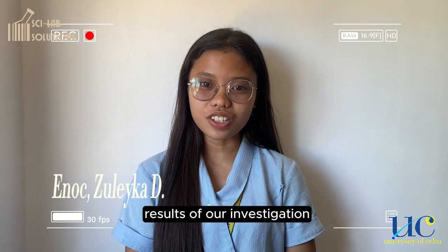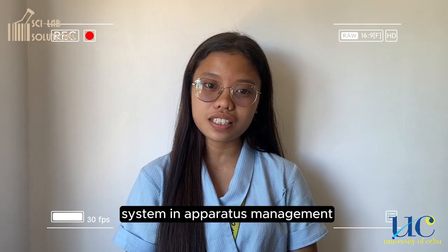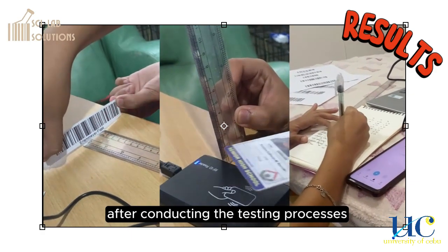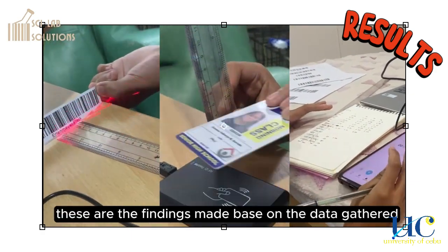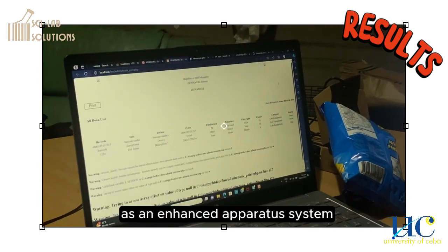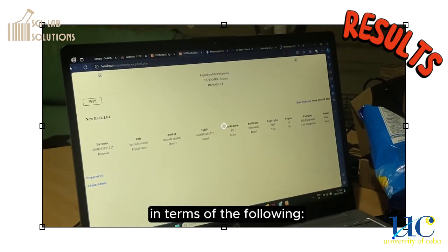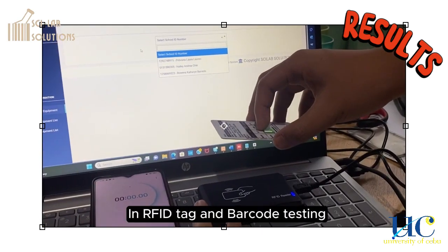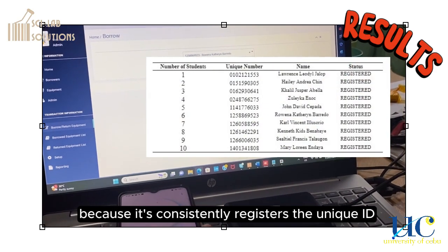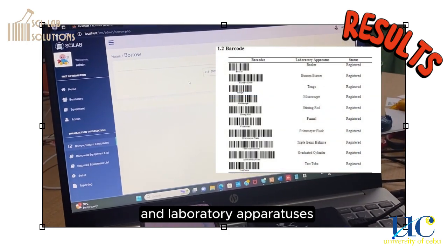Now, let us analyze the results of our investigation about the performance and efficiency of the Scilab solution system in apparatus management. After conducting the testing processes, these are the findings made based on the data gathered. First, the Scilab solution system is efficient as an enhanced apparatus system. Second, the Scilab solution system is efficient in terms of the following. In RFID tag and barcode testing, the Scilab solution system is functional and reliable because it consistently registers the unique ID numbers and barcodes of the tags and laboratory apparatuses.